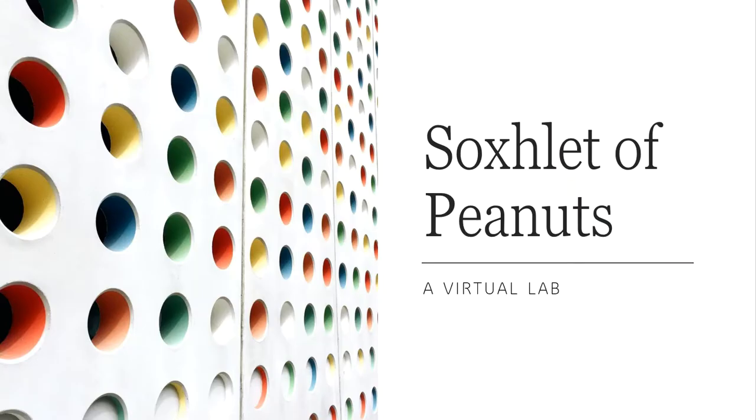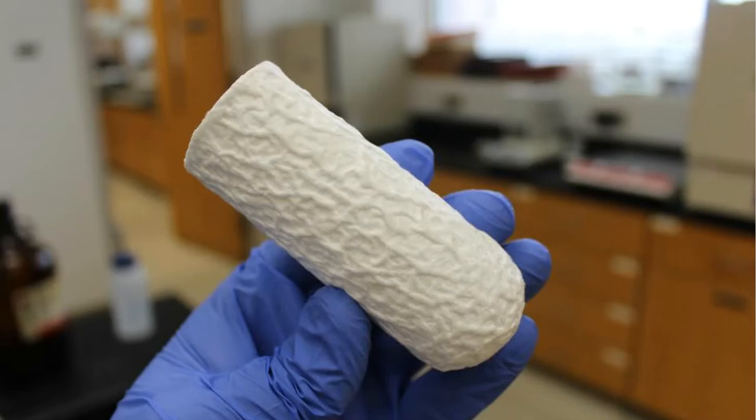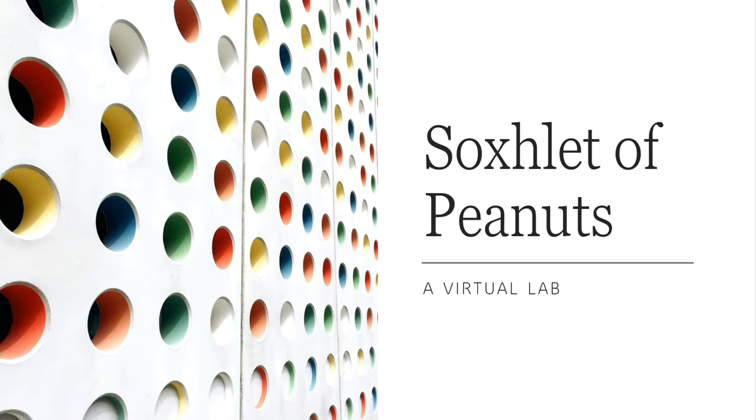So I had to put some crushed up peanuts into a thimble. I had to let this run for about 3 days. And that thimble held all of my nuts for those 3 days, and it allowed the solvents to extract, and all of the peanut oil came out in the very end. We put it in a rotovap, we distilled all of that solvent off, we were left with our peanut oil in the very end that we tested on a refractive index and on an FTIR instrument. So, not very complicated, not a lot of steps, not a lot of reagents. It was just a lot of waiting. And that's the problem with the Soxhlet.